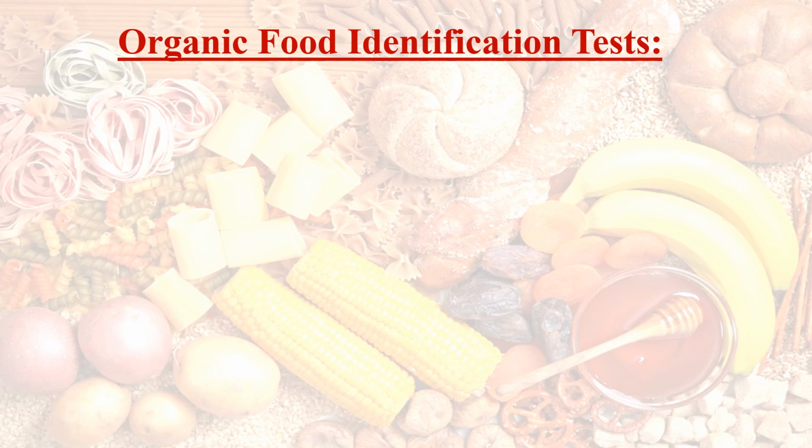We will start our session with listing the different organic food identification tests. We have three types of organic food: proteins, carbohydrates, and lipids. In this session, we will see the different identification tests for these organic foods.